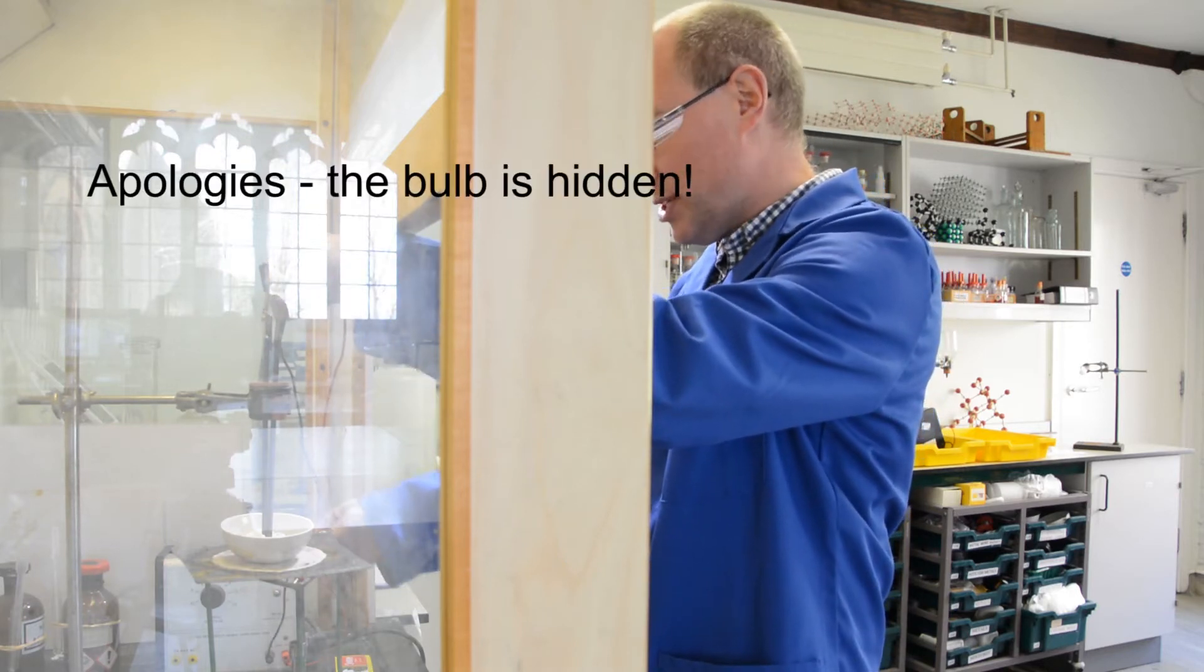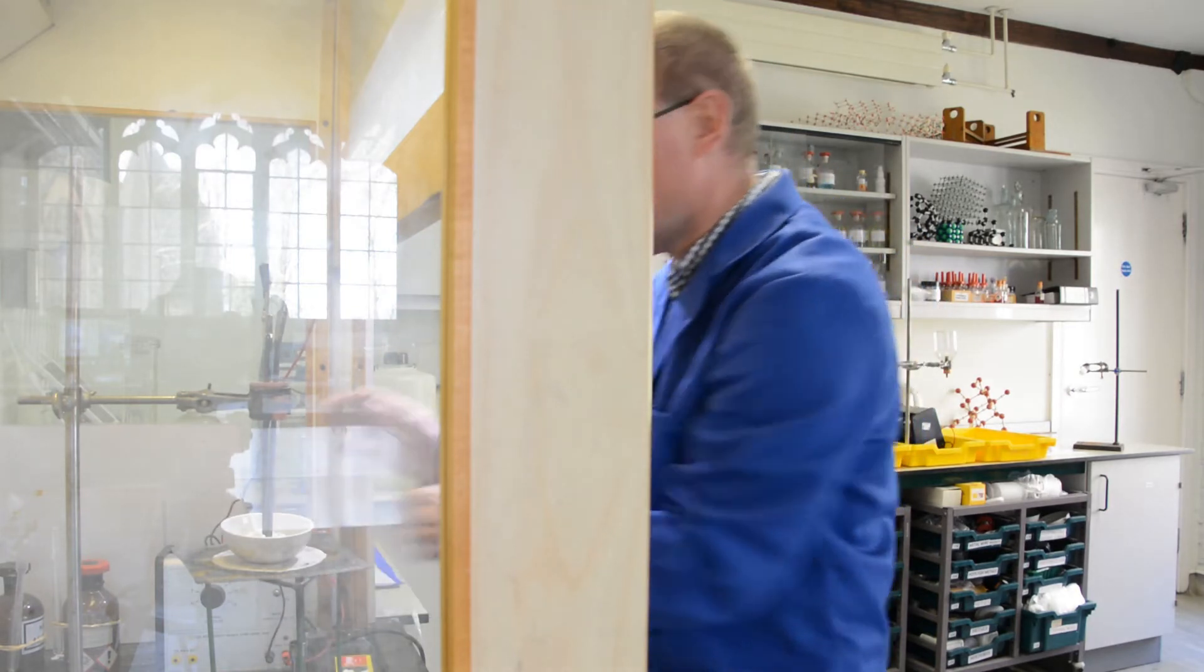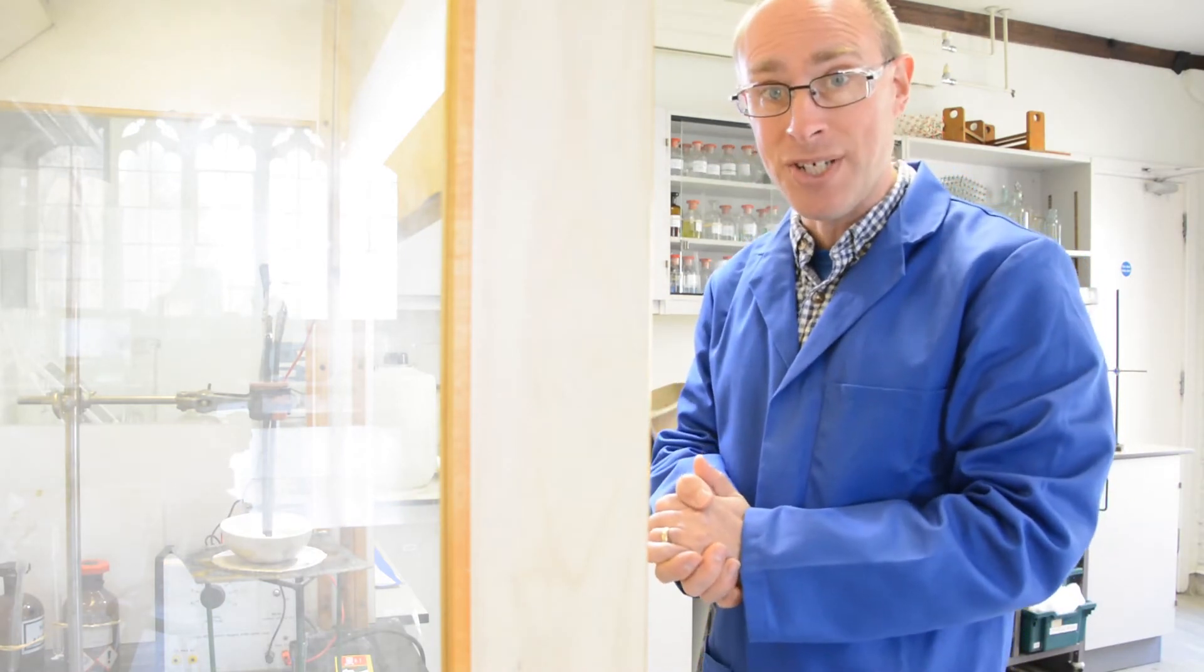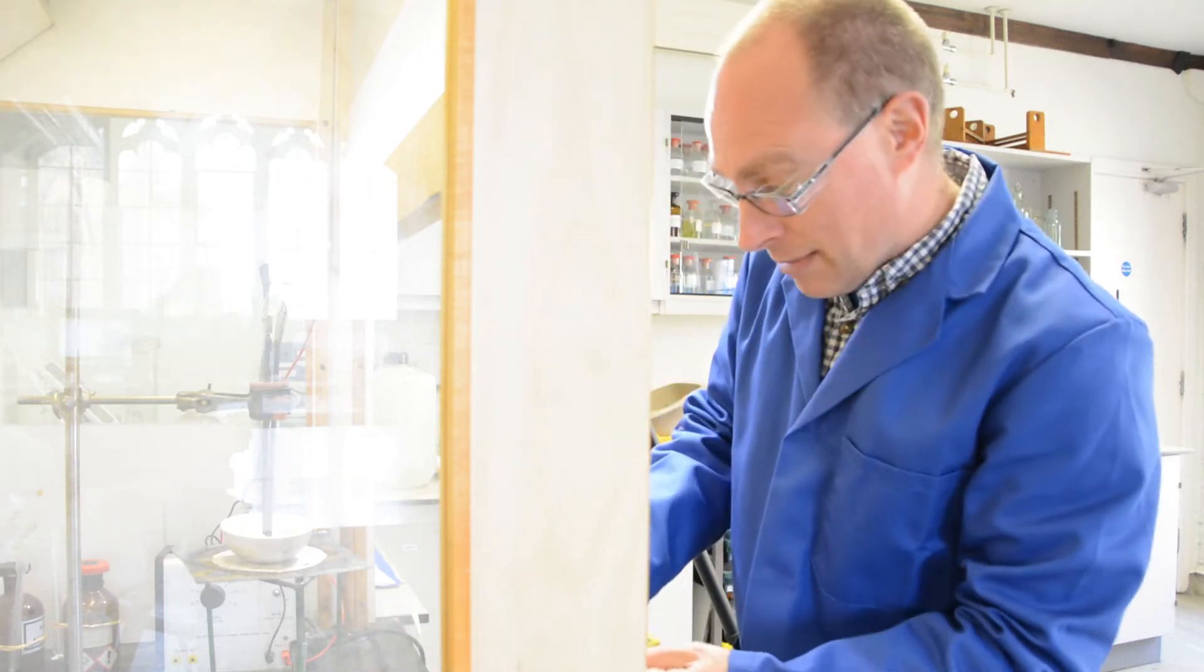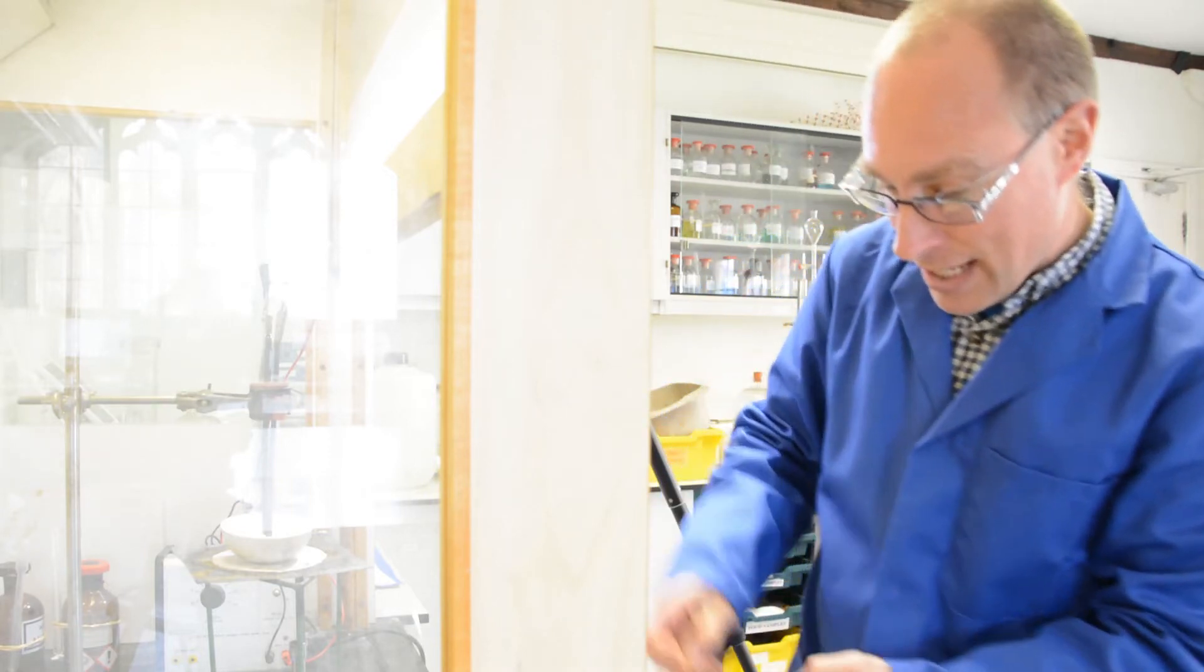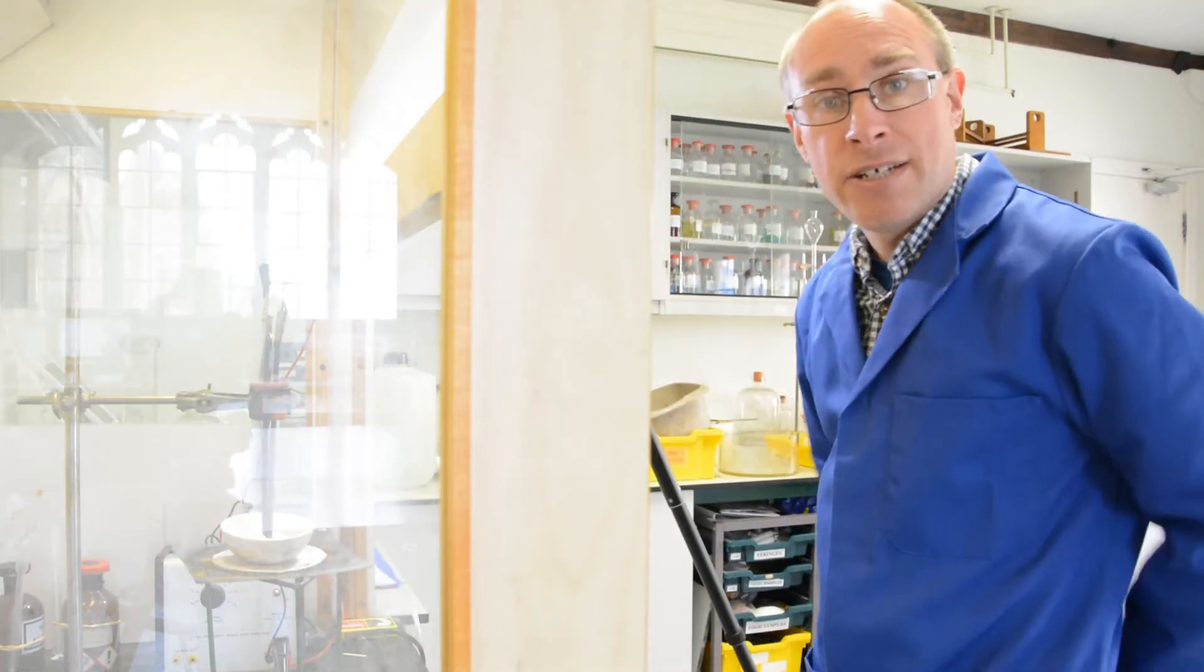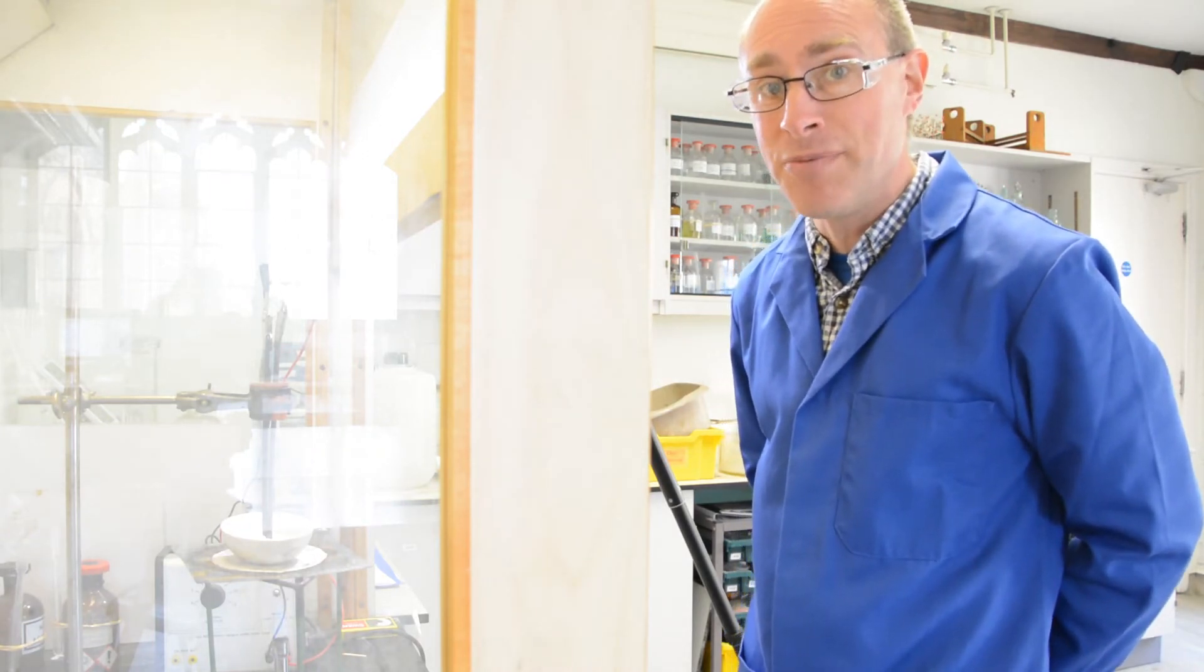So at the moment there's no current flowing because the lead bromide is solid, and because it's solid the ions are fixed in position and cannot change places. So I'm going to light the Bunsen burner and start to melt that lead bromide, heat that up strongly. That will take a few minutes to melt completely.